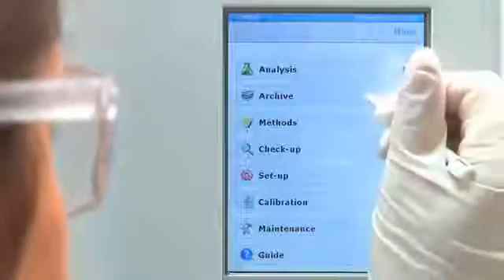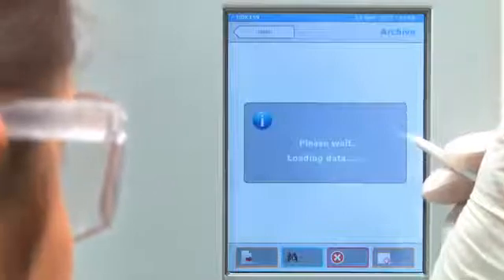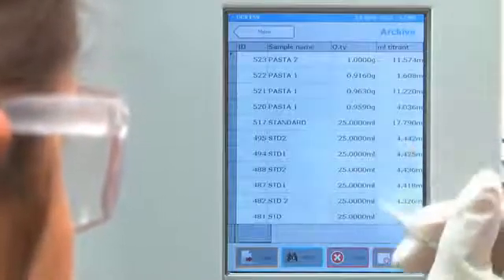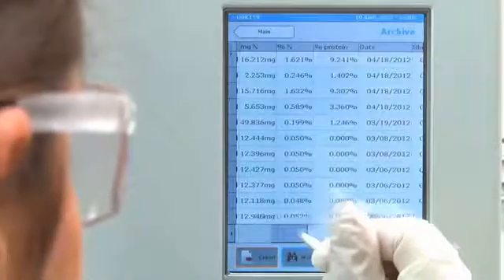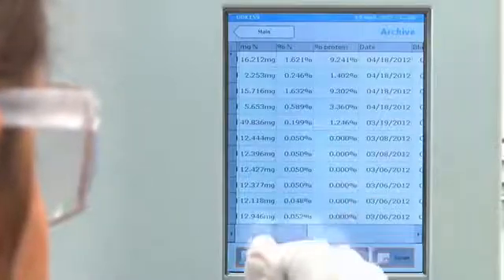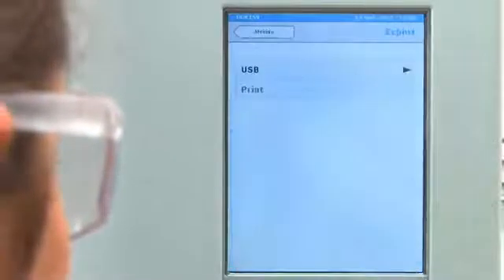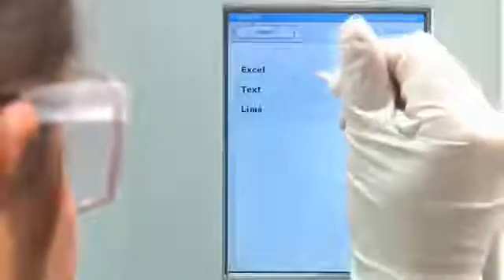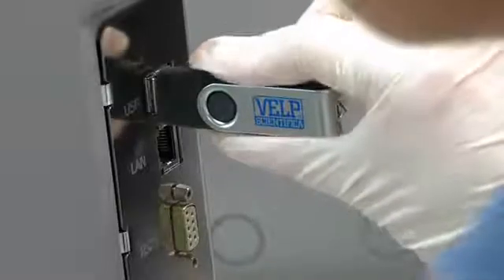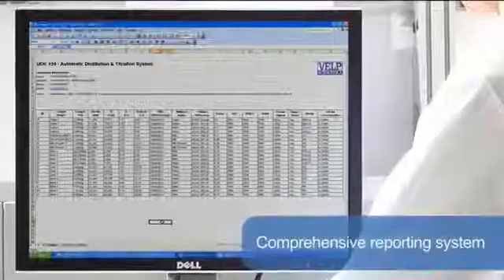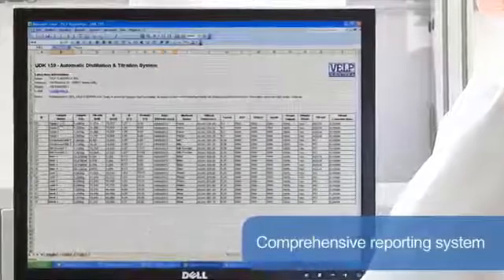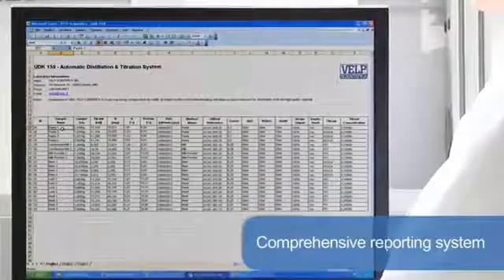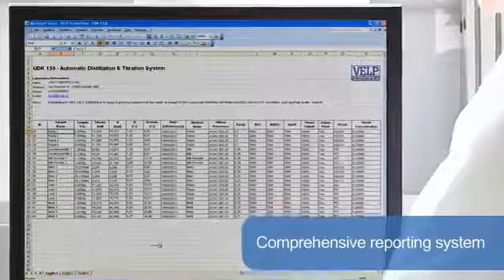Following distillation and titration, the display presents all the results that are stored on the onboard archive for enhanced traceability and improved operation in accordance with GLP. The data can be managed remotely via ethernet or exported to a USB pen drive. The comprehensive reporting system offers downloading to PC and transferring to LIMS for maximum flexibility data management.